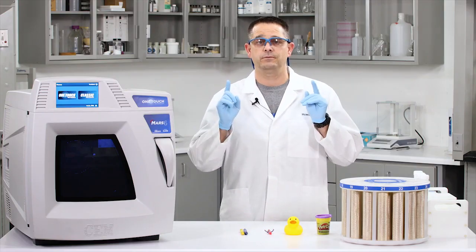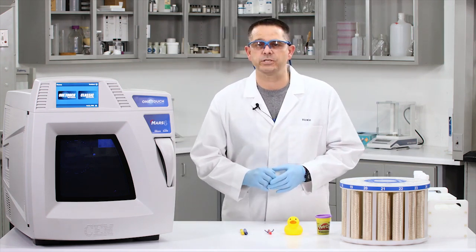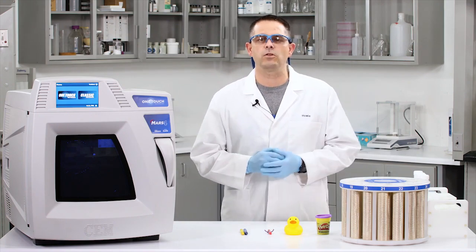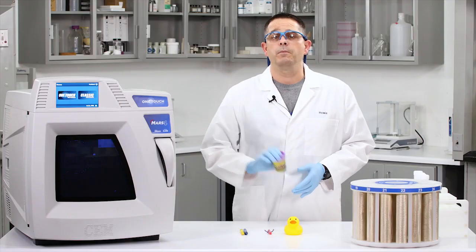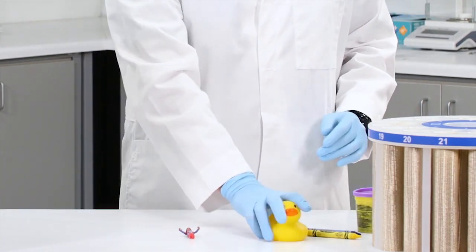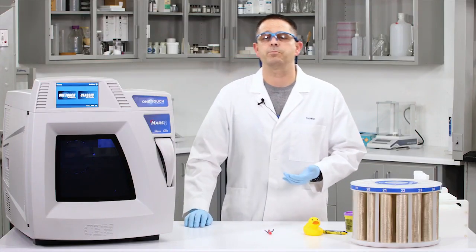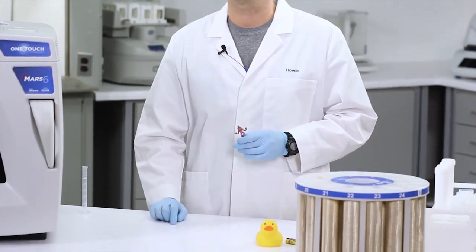So what we're going to try to do today is let's see if we can do all of these samples in one batch simultaneously. In order to do that, I'm going to use the Mars Express Plus. It does have a little bit larger volume, which is going to allow me to do a little bit more sample size. All right, so Play-Doh, our crayons, and a rubber duck don't need any additional sample prep. We can just use them as is. However, our figurine will need to be ground.